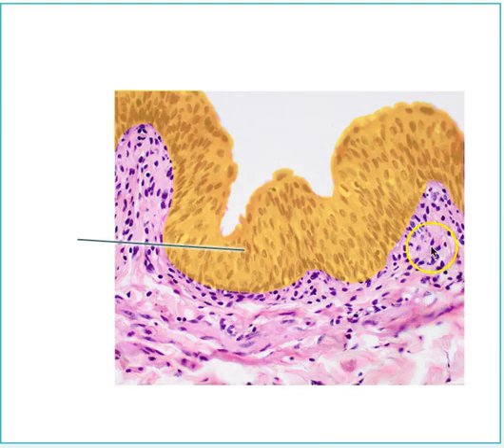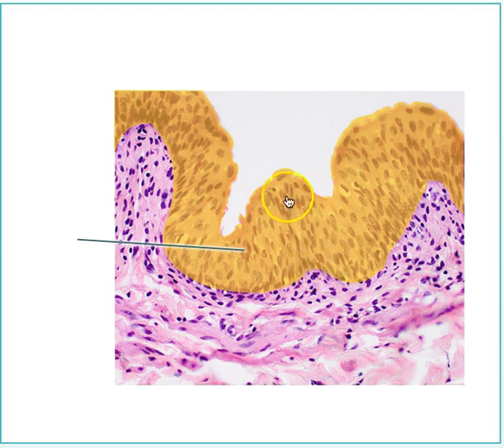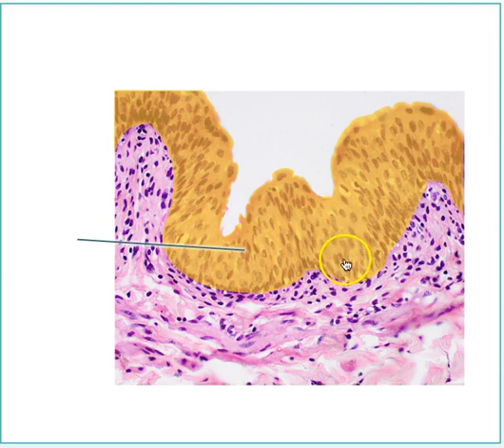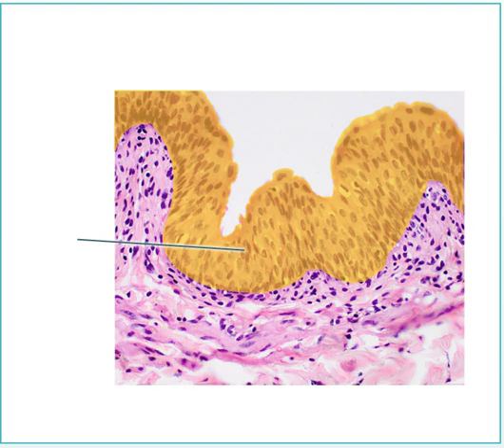I'm seeing a bunch of different shapes for the cells. I'm also seeing those umbrella cells we talked about. Because of all these different shapes, it's definitely not pseudostratified. And because of these wide umbrella cells sitting on top, this has to be transitional epithelium at a bit of a higher magnification. This is found in the urinary bladder.